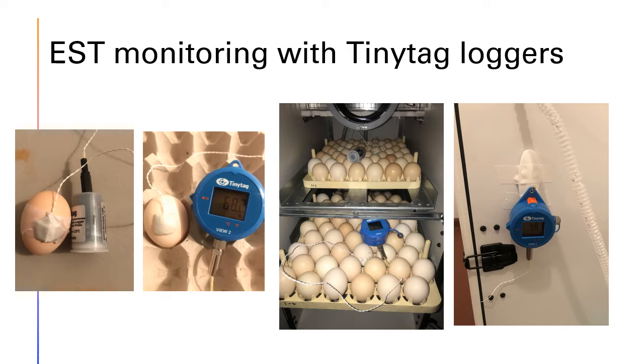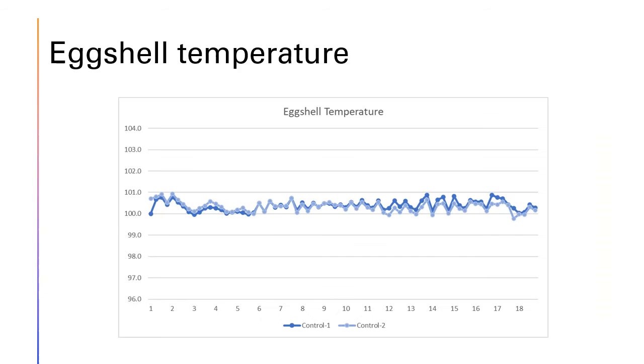Actual temperature was monitored by TinyTag temperature loggers. They have an external probe and can detect fast-changing temperature in difficult-to-access areas with 0.01 Celsius sensitivity. 2 loggers are positioned for 1 incubation group. 1 logger has a monitor installed, which helps in adjusting incubator temperature without opening the door.